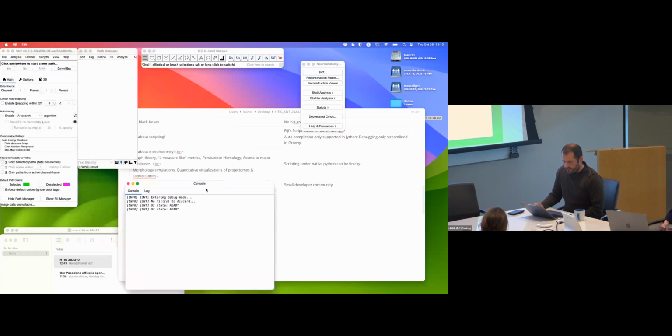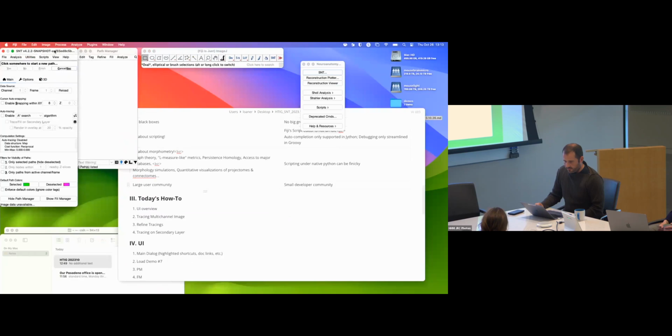Tiago, if I can interrupt you. Yes. You're clicking buttons really quickly, and I don't always see exactly which ones you click on. Oh, I see. Okay, I'll do it slower. Say what you're clicking on.